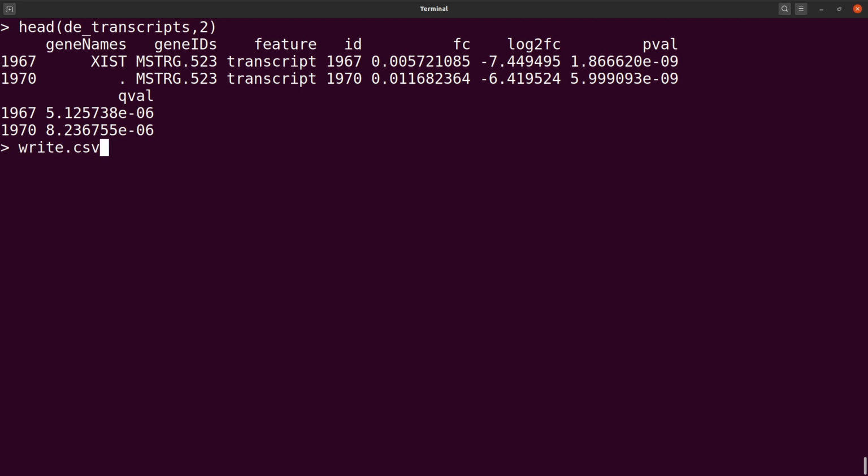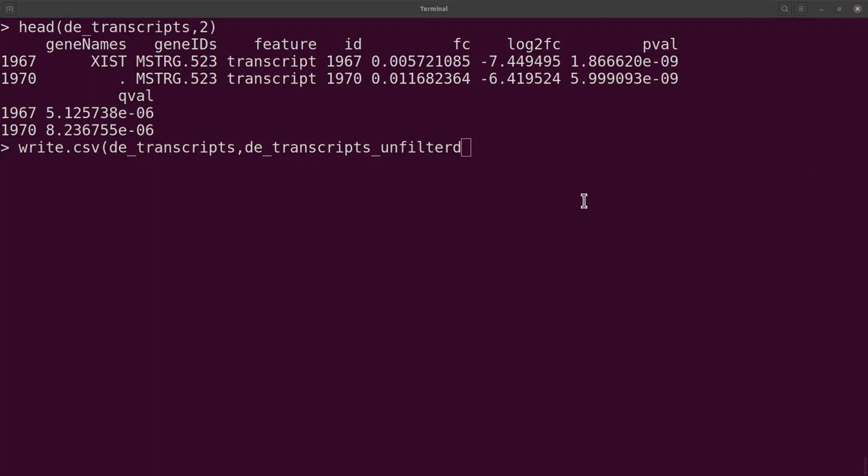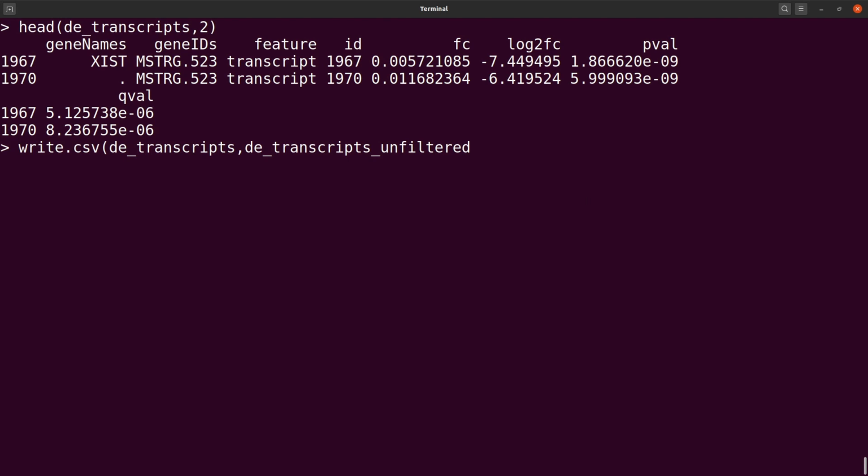We are going to write them to an output file. So let's start with the transcript. So we say de transcripts, and then we specify an output file. So let's say de transcripts unfiltered. Let's put it this way. So yeah, unfiltered.csv.